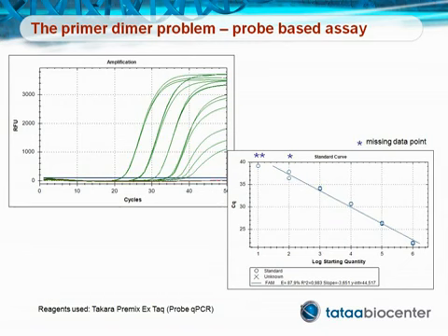You will then have amplification curves that come later than they should have or that do not show up at all, and it will look like you had a lower amount of the target DNA in the sample than you actually had, thus wrong quantification. In the standard curve, you may get missing points in the lower range, and also here you should be careful with samples that come within this region, which will be outside the quantification range.